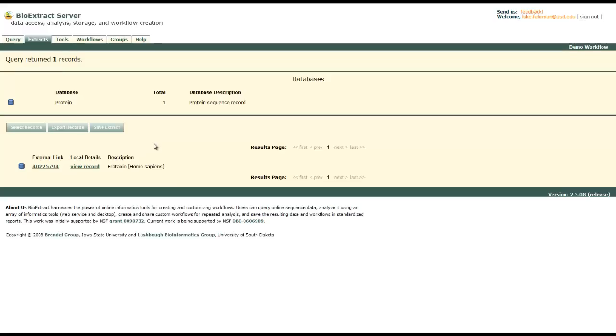We could export this file if we'd like. We could save it on our own drive, use it in Jalview if we didn't like using the tools from BioExtract Server. But personally I do.